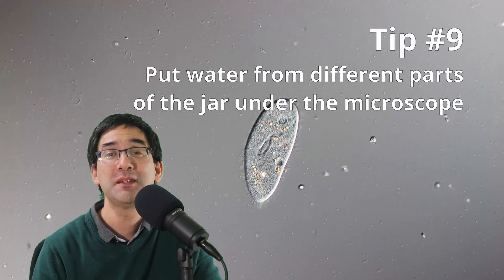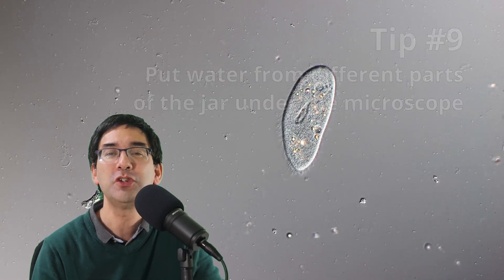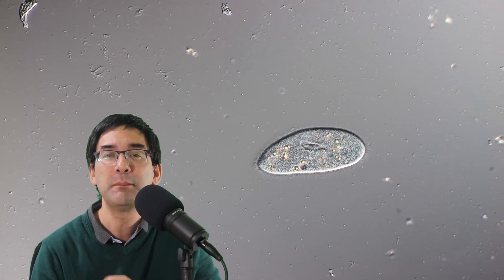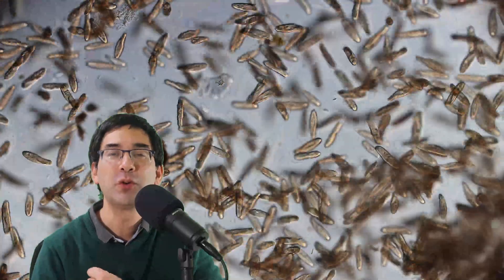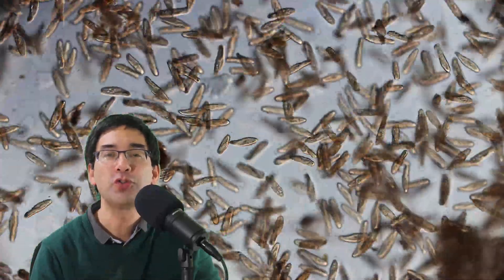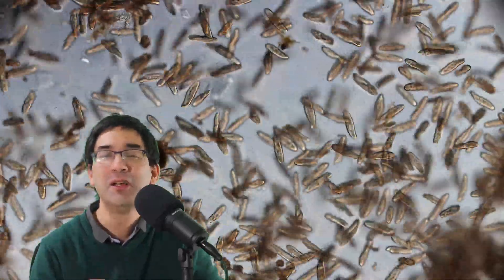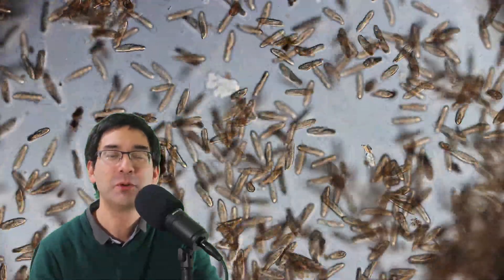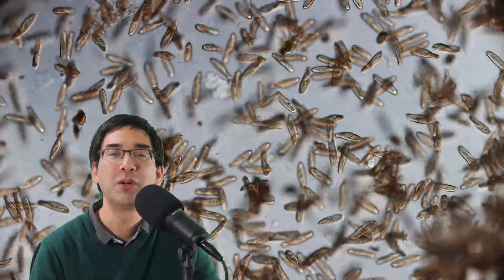Tip number nine: there are different parts of the jar — the bottom, the top, around the algae, around the food. Put samples from different parts under the microscope and you'll see that different microorganisms accumulate in different zones. For example, microorganisms that need a lot of oxygen can probably be found around the algae and at the surface where oxygen concentration is highest, while others gather more around the food. You'll be quite surprised which microorganisms you find by experimenting.